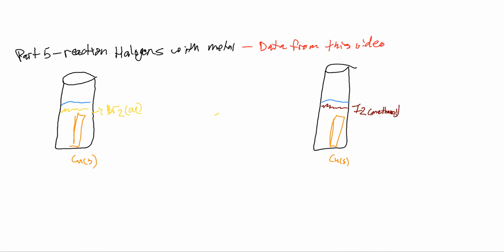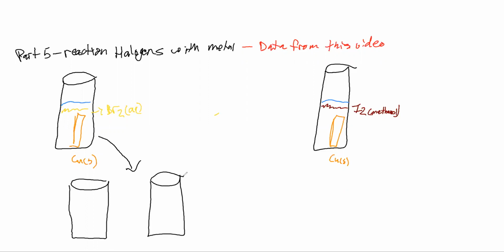So we mix those together, and then we're going to test them to see if we have any responses. So we shake, shake, shake. We mix, mix, mix. And I'm going to separate my first one, this bromine one, into 2 containers.